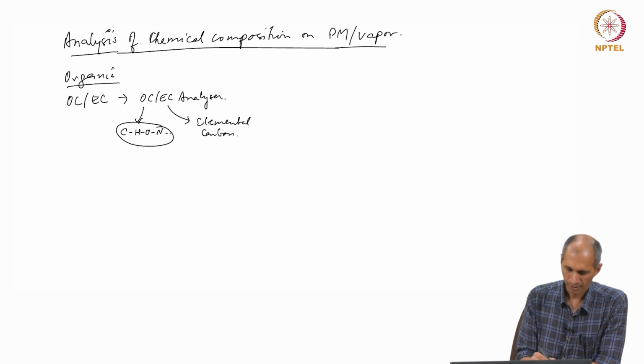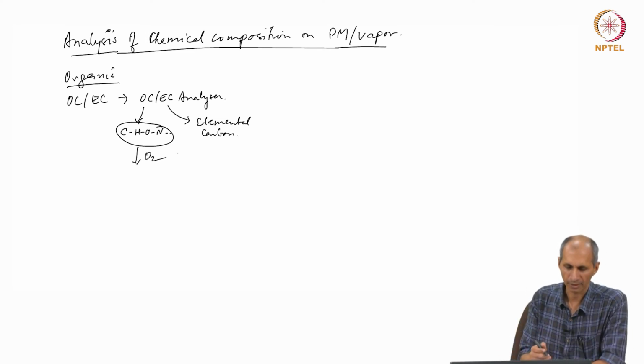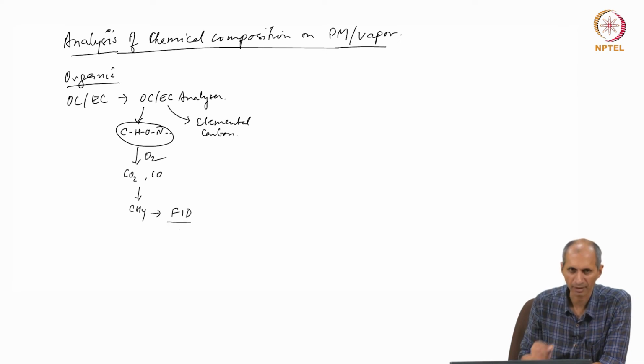So, this portion you can combust it, you can oxidize it, like the organic carbon analyzer we talked about long back, what is called total organic carbon. You combust it and whatever comes out you measure the CO2 or CO using infrared. Instead here what they do is they oxidize it, you get carbon dioxide or carbon monoxide. This is converted back to methane using a reduction reaction. So, this methane can be detected using a flame ionization detector.